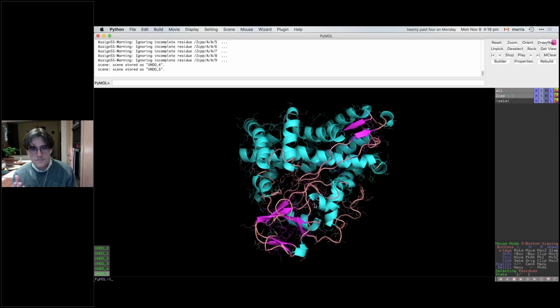And we use a technique called depth queuing, which changes the shade, if you like, of parts of the object that are further away and blends them more into the background. So it's a bit like a fog.